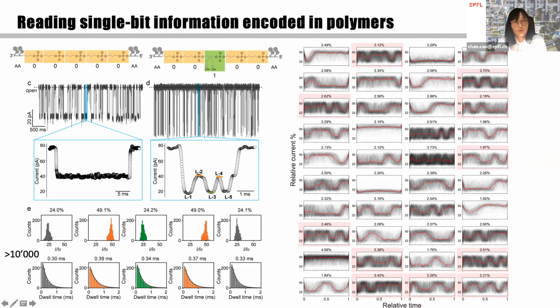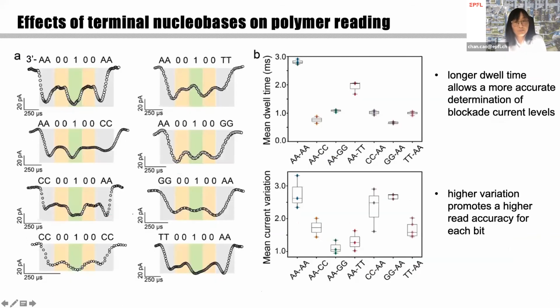Here, I just want to show you the clustering of the signals from this polymer. Because it's single-molecule behavior, it can be super dynamic. It can be super fast at the beginning or super slow at the beginning. All can happen. That's why we often do statistical analysis to double confirm that what we observed happened many, many times in the whole system.